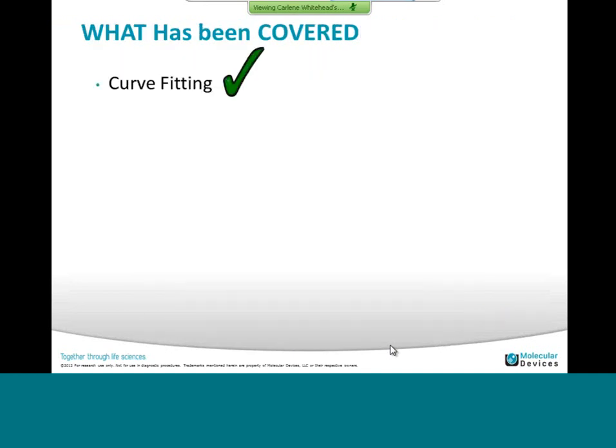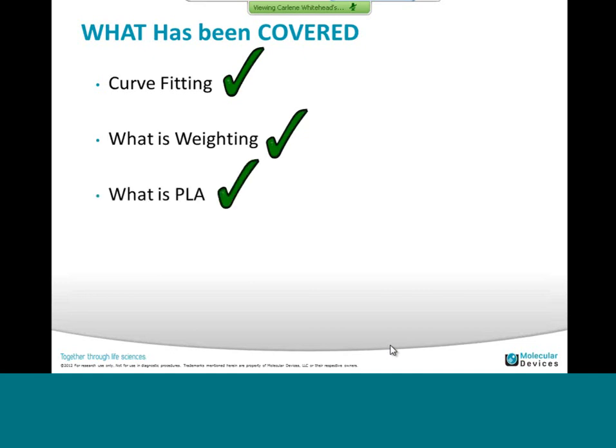So today, what we've covered, well, we've gone through a lot. First, showing you the curve fitting and the protocol helping you to choose the best curve fit model. Then we explained what weighting is and how you can test different weighting factors using a protocol inside SoftMax Pro. We have covered PLA and the methods that have been implemented in SoftMax Pro and its protocol. And finally, we have covered the confidence interval and how to implement this in the software.